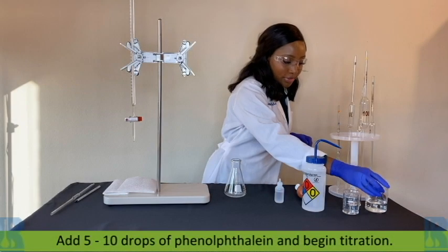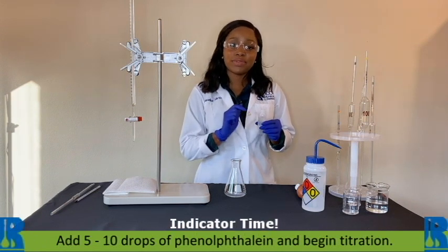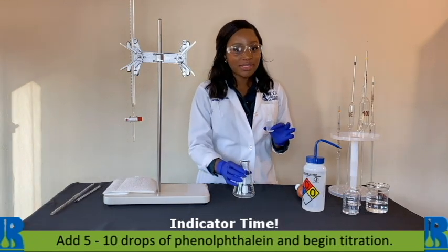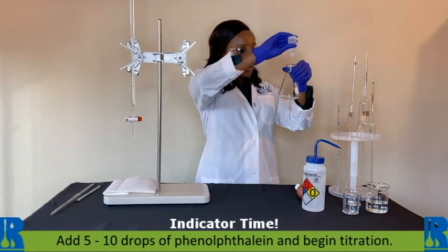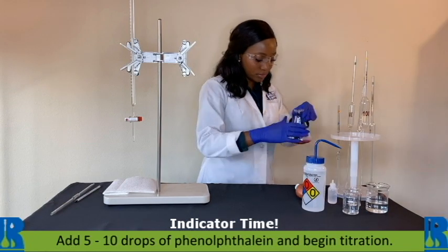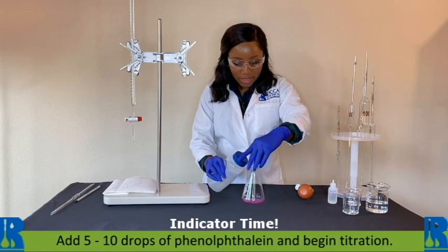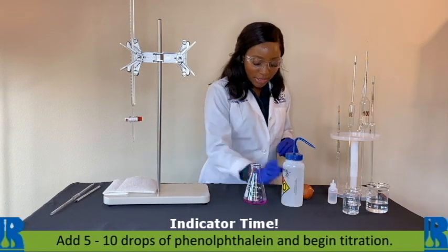We will add our indicator now. We like to do about 5 to 10 drops of phenolphthalein, and that's really just based on the concentration of your base. In this case, because we're at 20 percent, I'll do around 5 drops: 1, 2, 3, 4, 5. Then we can rinse the sides of our flask with some DI water to make sure our sample is all in the bottom of the flask.